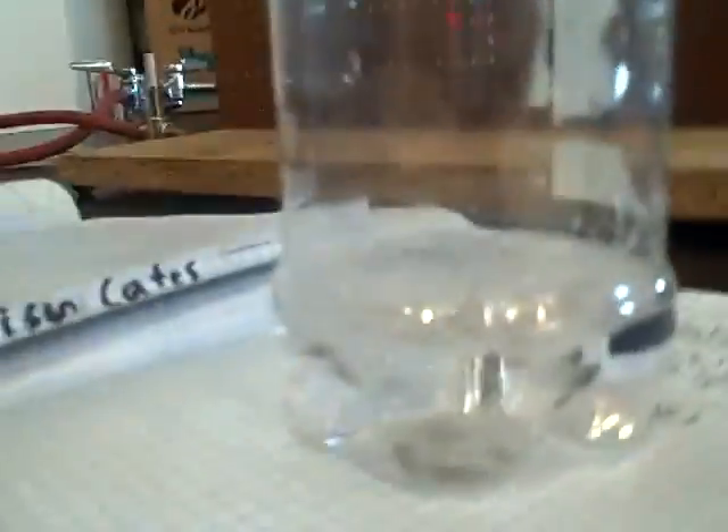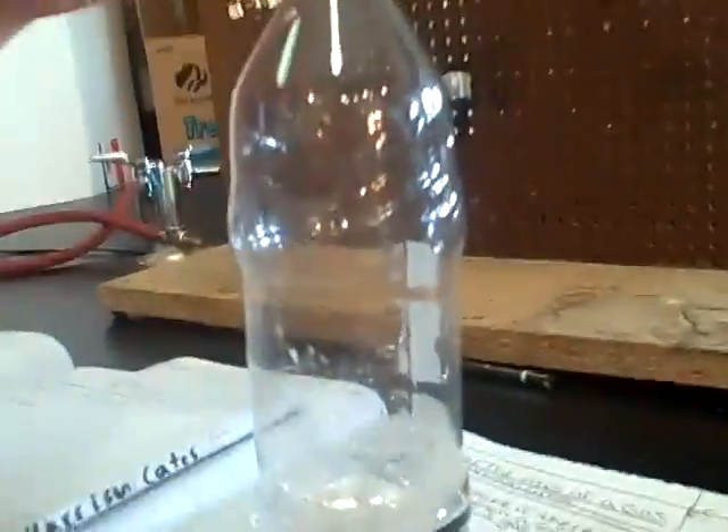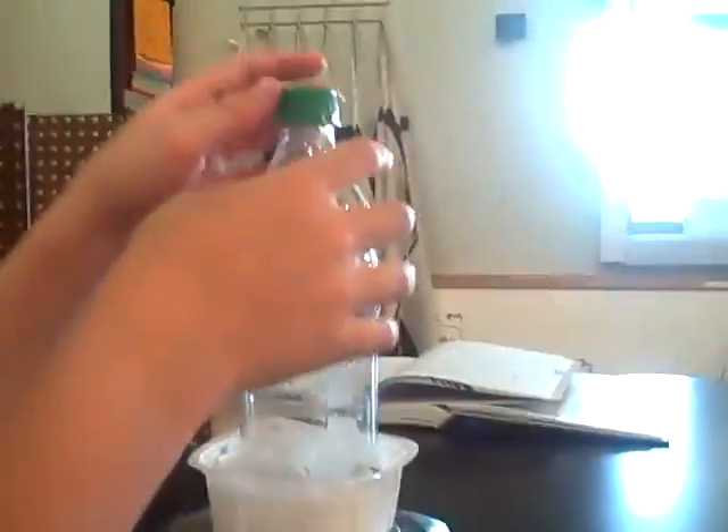Now we're going to loosen the cap and find the mass. We've just released the cap so that the gas can escape. And it's now 107.72, so it's gone much lower — about 0.13 grams lower. So there was a change in mass when we took the cap and loosened it.